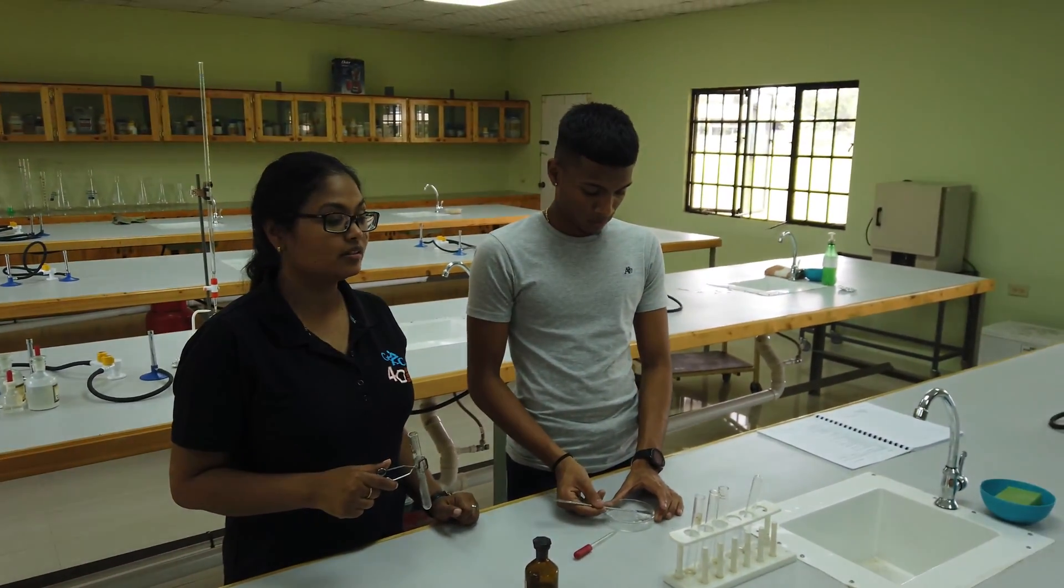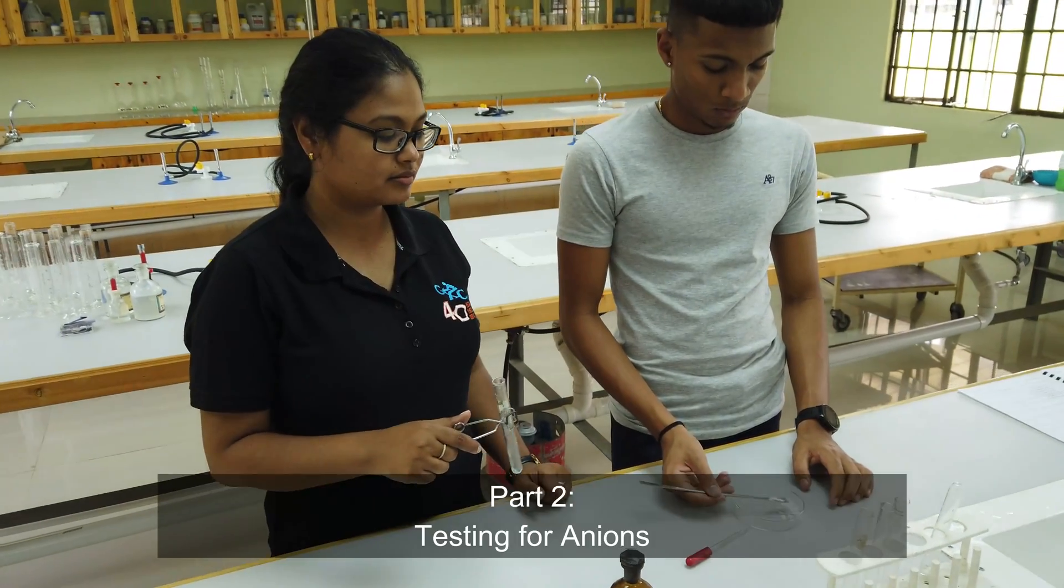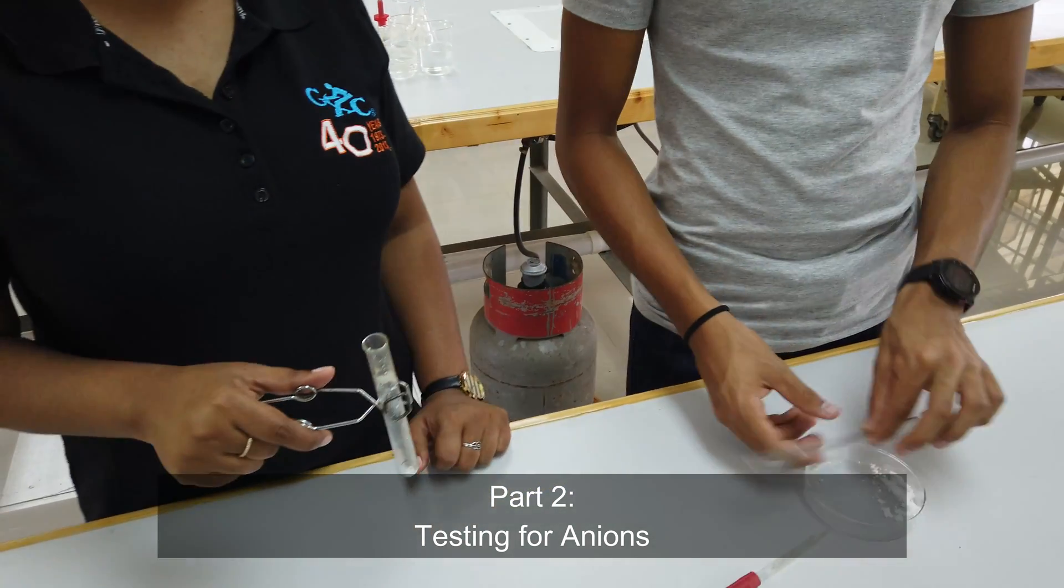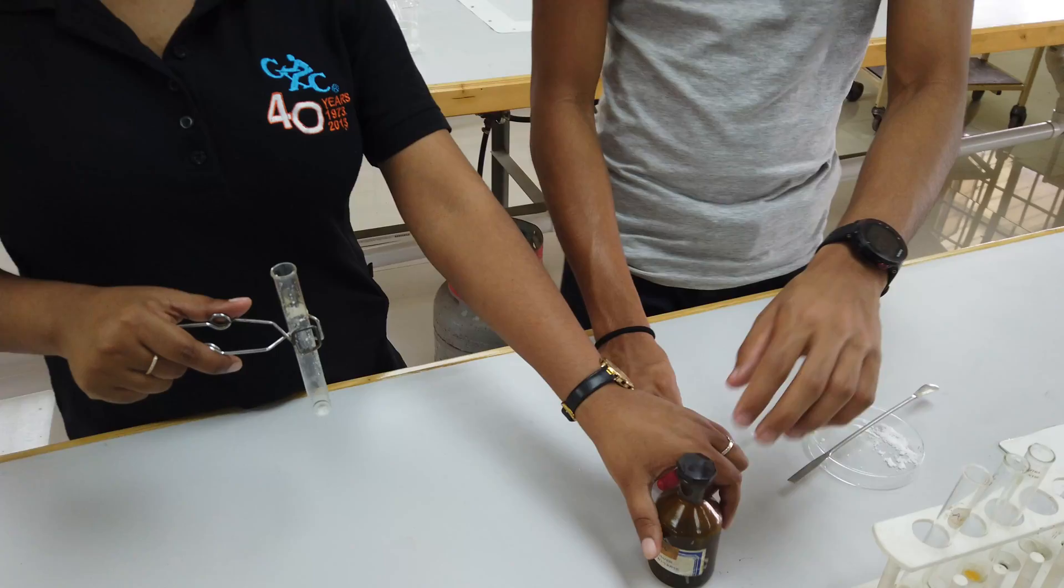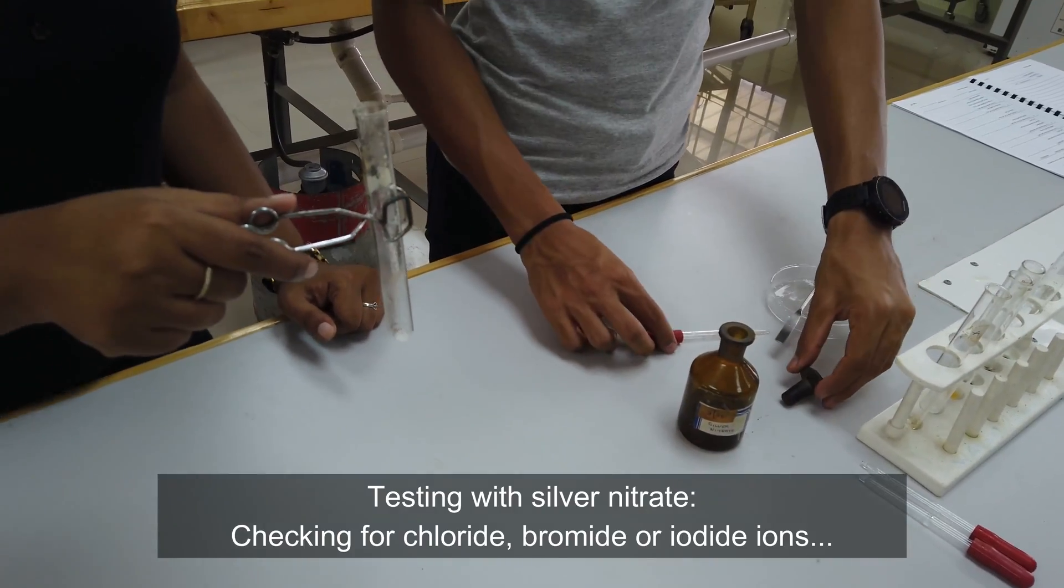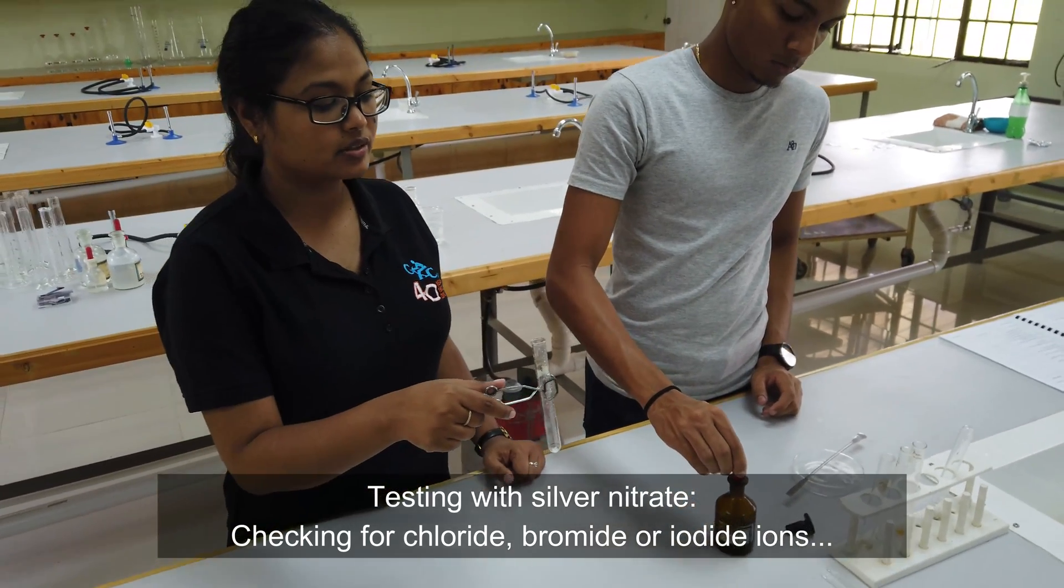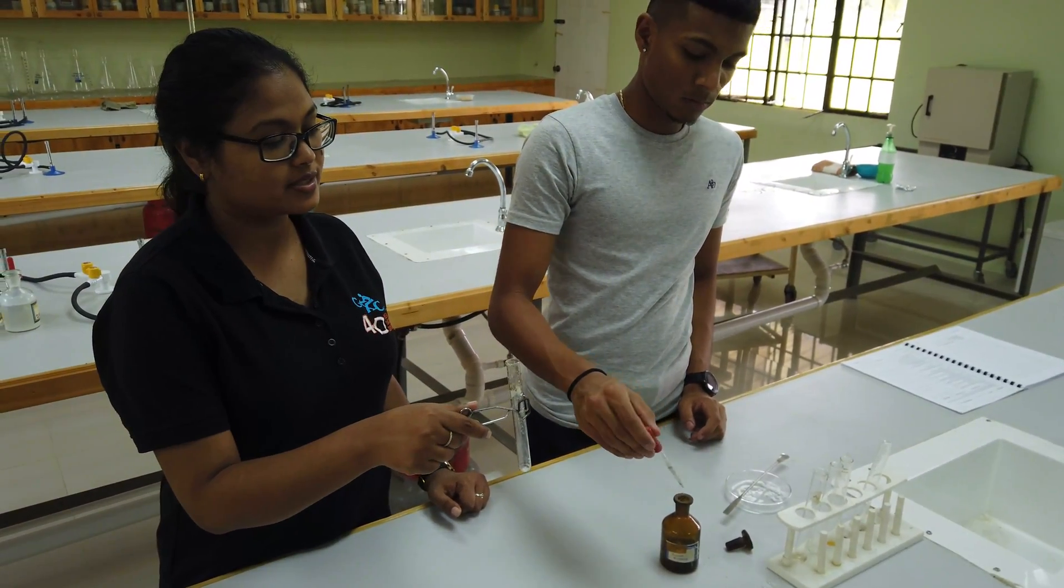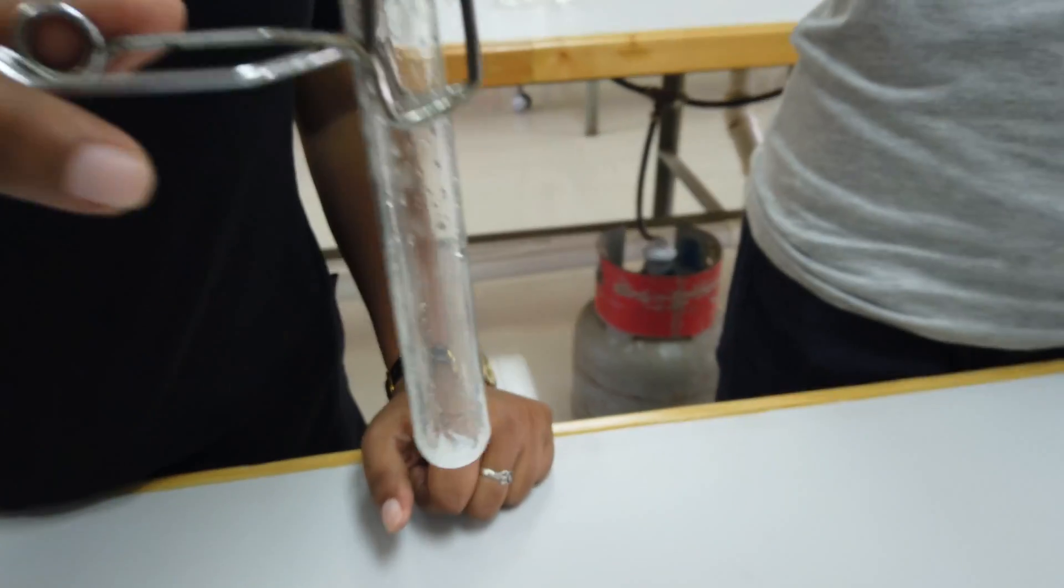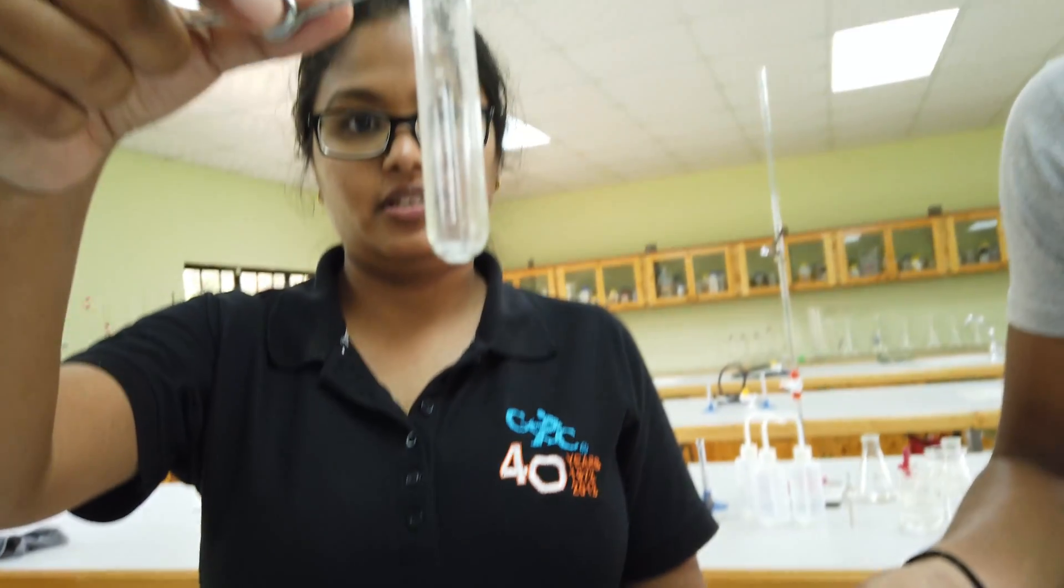Now that we know the cation is lead, we're just gonna go ahead and test the anion. Little bit of salt, and to this we're gonna add some silver nitrate. We're looking for a precipitate. If there's a precipitate, it means chloride, bromide, or iodide is present. If there's no precipitate, it means that none of these things are present.